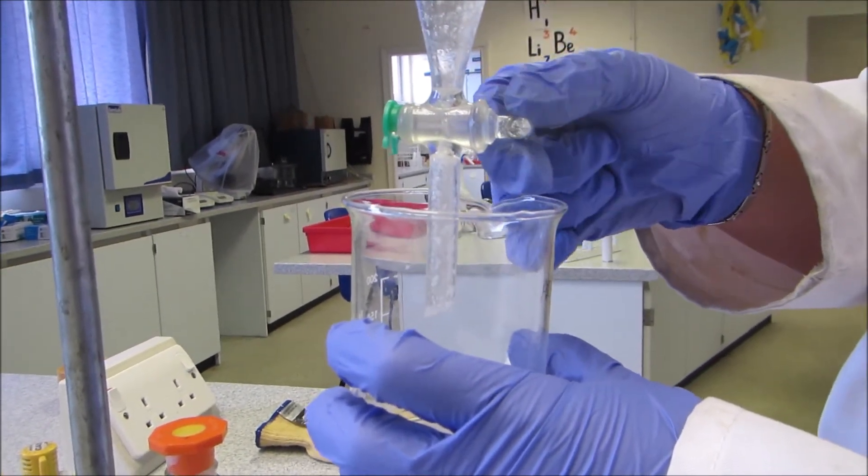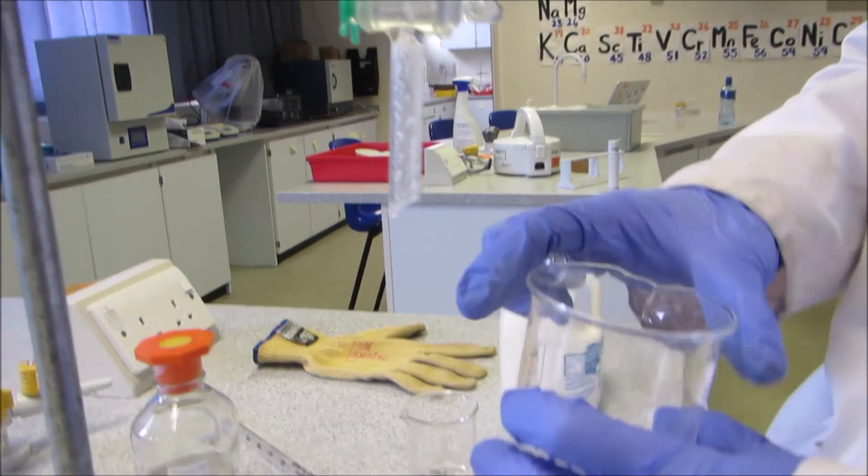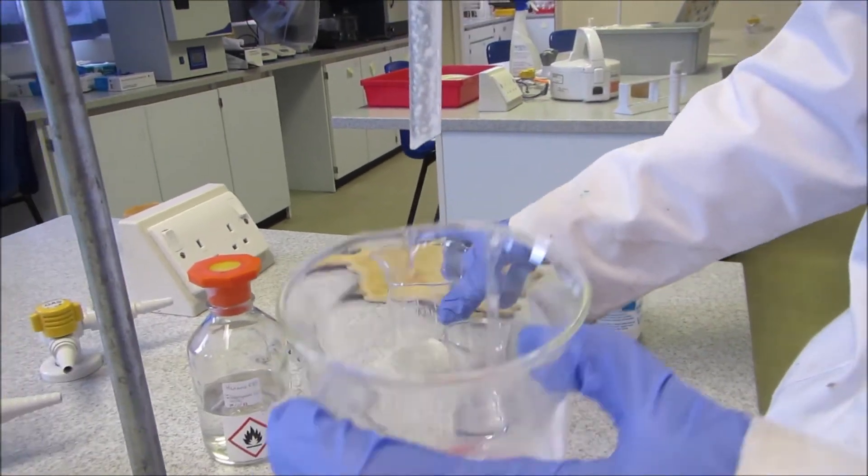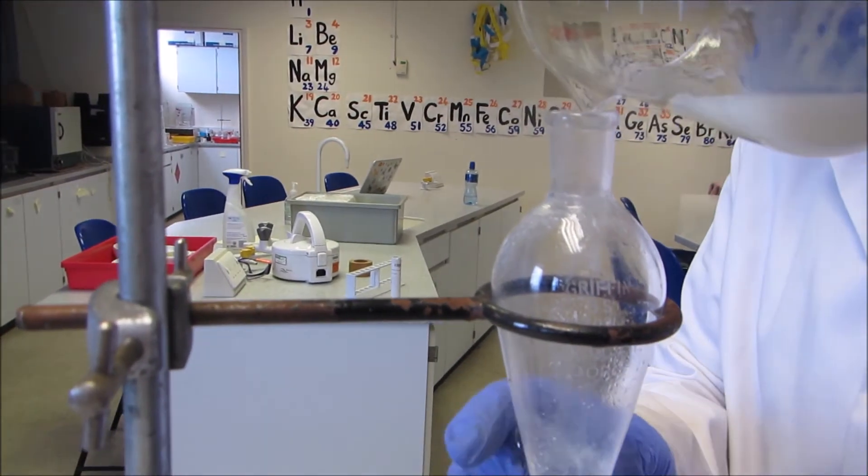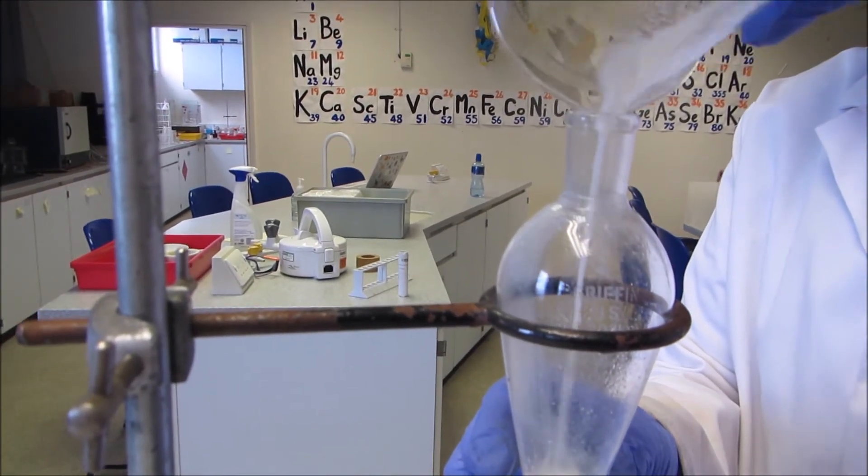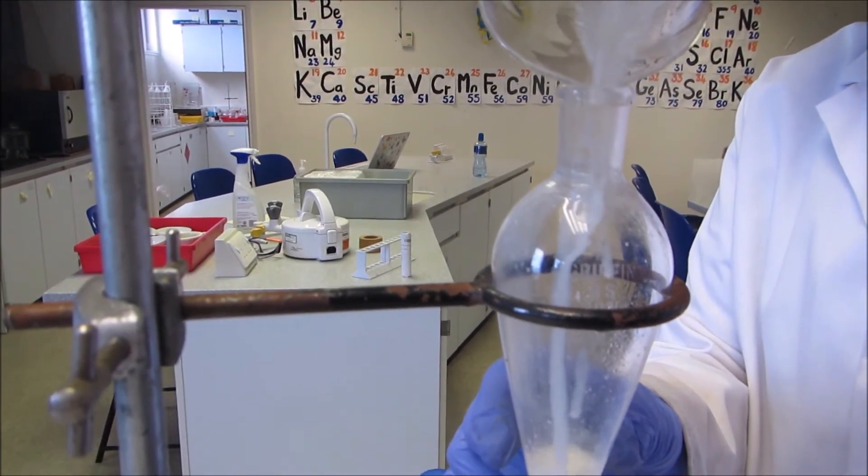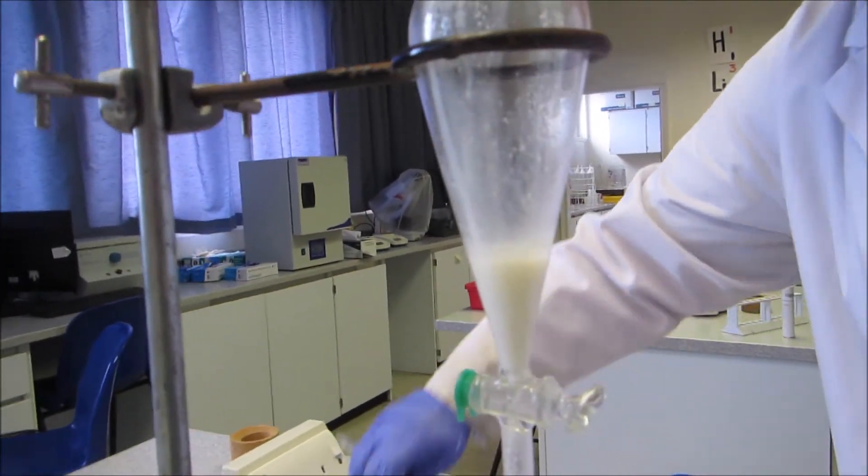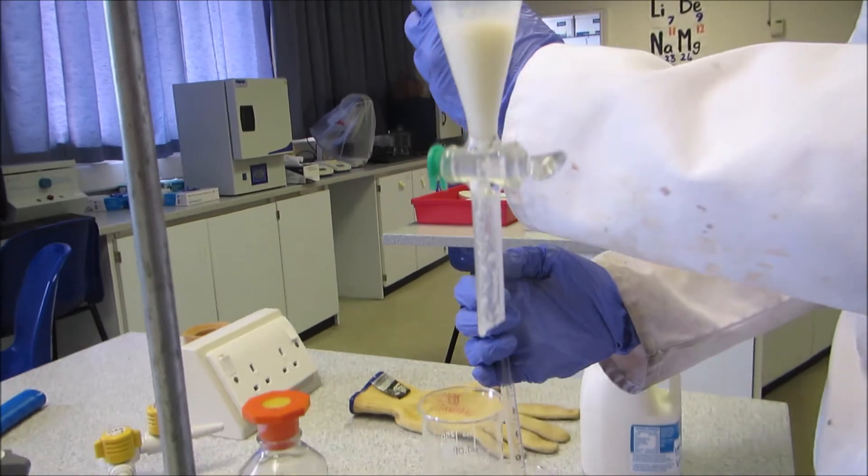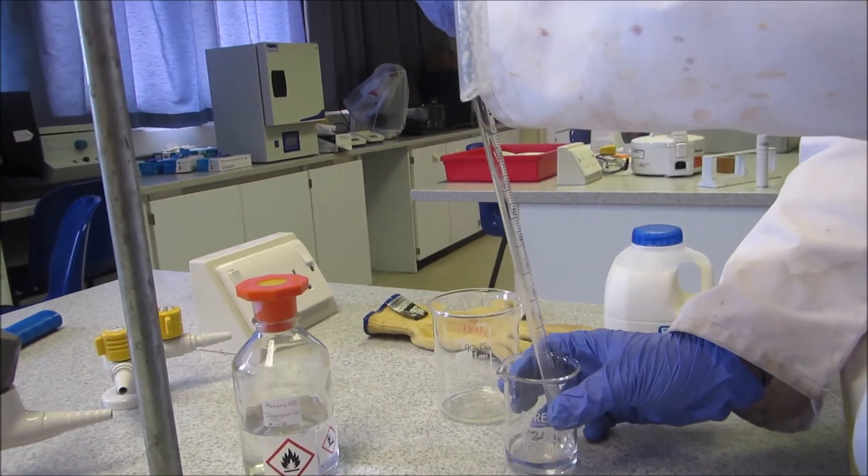So that's the first extraction. That will have got some of the fat from milk, but we want to make sure we've got all of it, so I'm just going to put the milk layer back in. That was our bottom layer, as much as I can. And then measure out another 7ml of our solvent and do a second extraction.